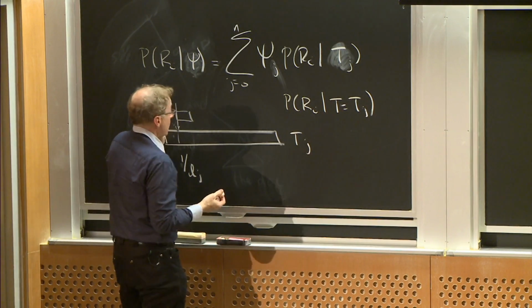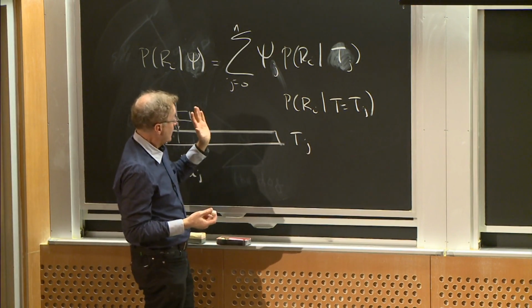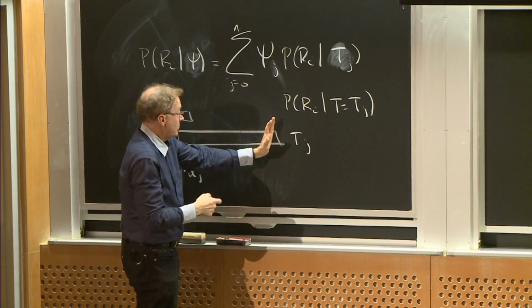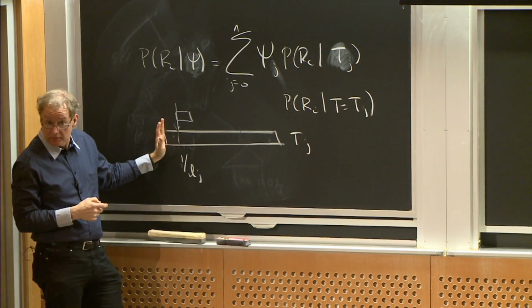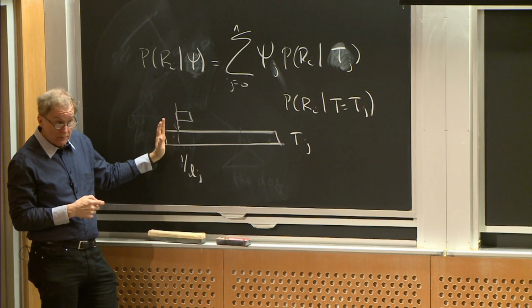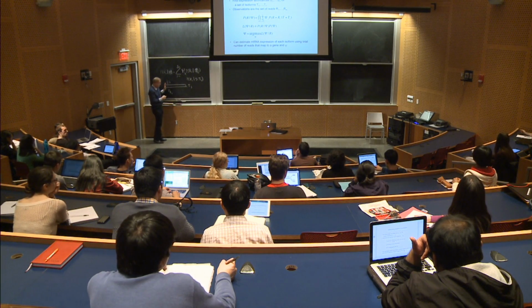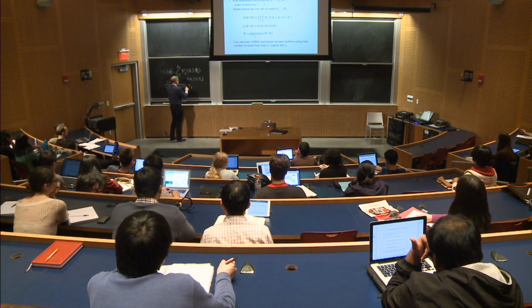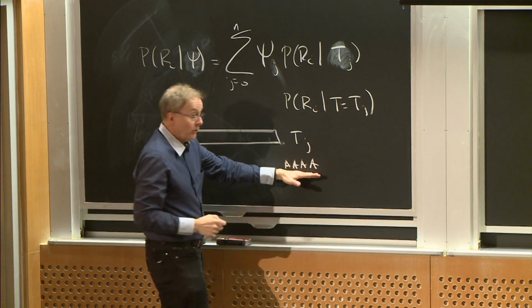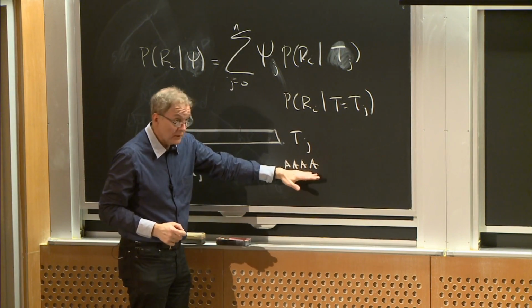Sometimes we would have more reads at the 3' end of a transcript than the 5' end. Can anybody imagine why? Yes. Because you're pulling on the poly A tail. Yeah, so this was actually purified by the poly A tail, and we're pulling on this, or purifying by it.